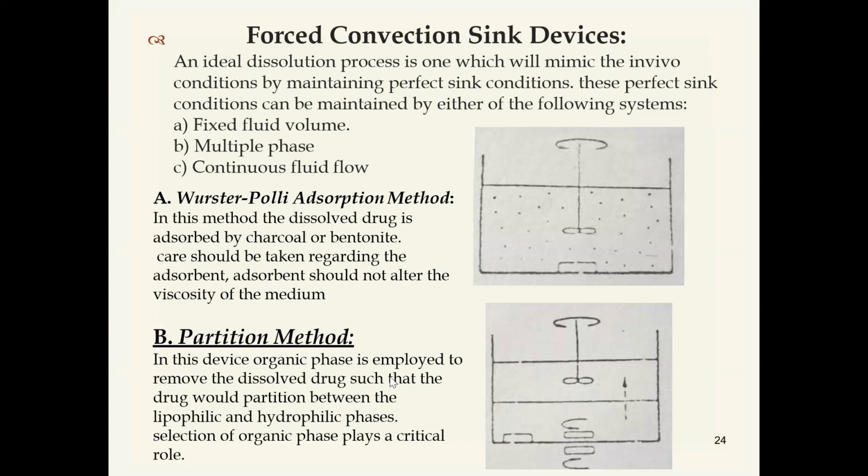In this, the organic phase is employed to remove dissolved drug, so that the drug would partition between two phases, that is lipophilic and hydrophilic phases. So here we need to take care of the organic phase. Selection of the organic phase is very important in the partition method, because here partition takes place.